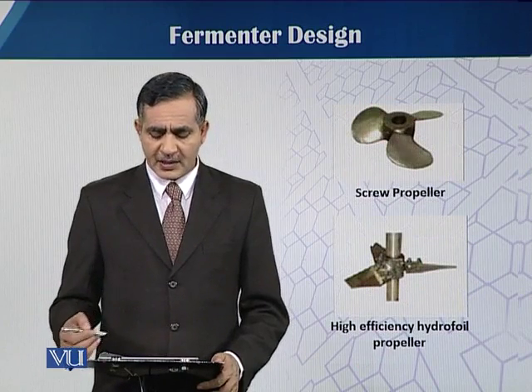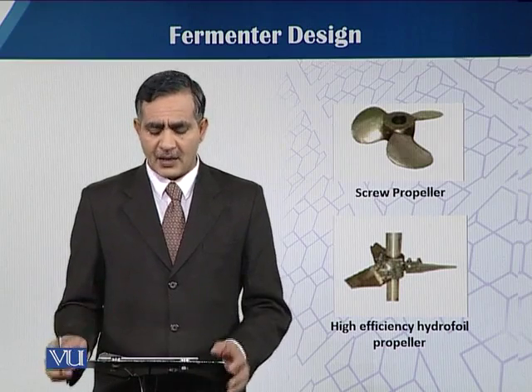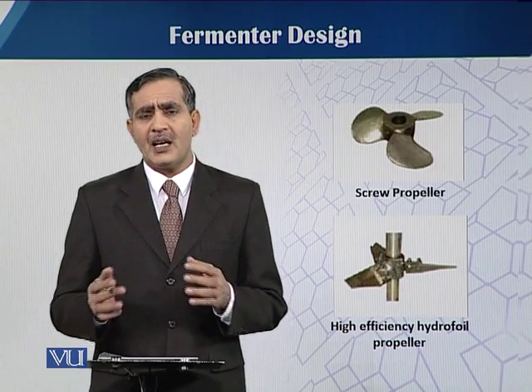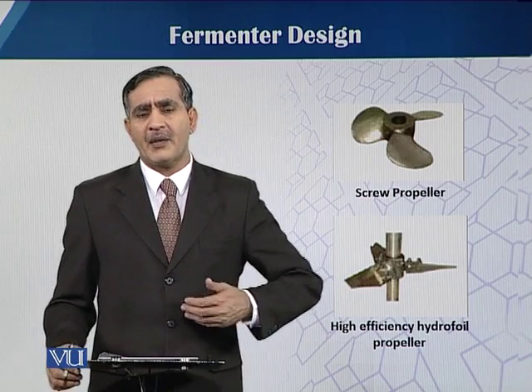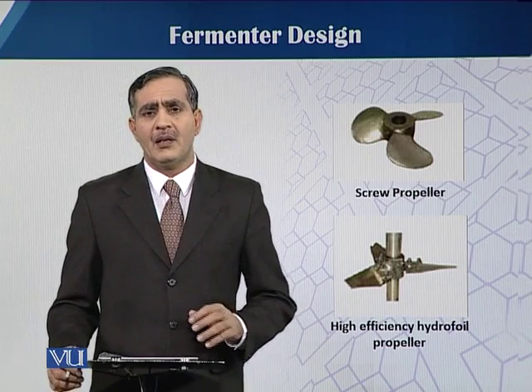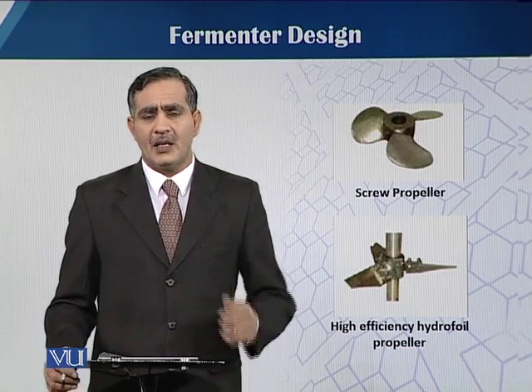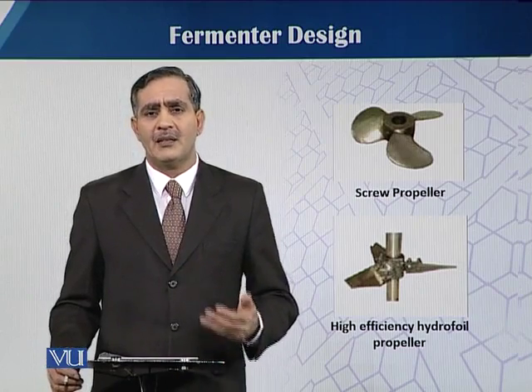In this diagram you can see axial flow impellers having different shapes of blades. These are the different impellers used in designing fermenter vessels. Because mixing in a fermentation process is very critical, while designing the fermenter we have to be very careful in fixing the impellers.